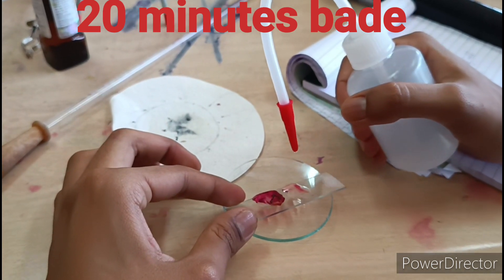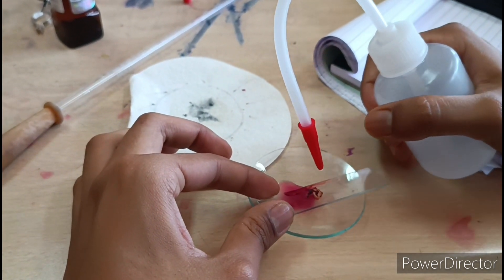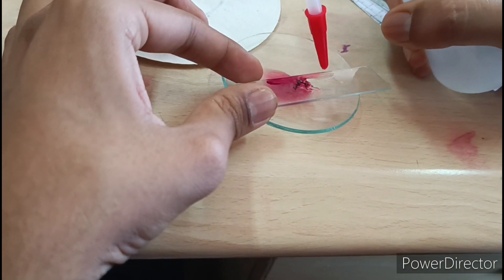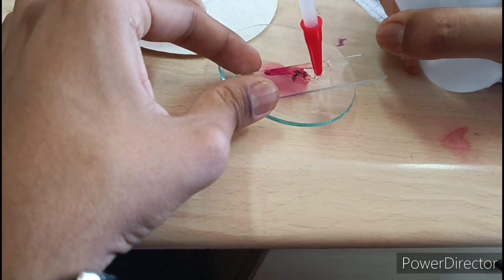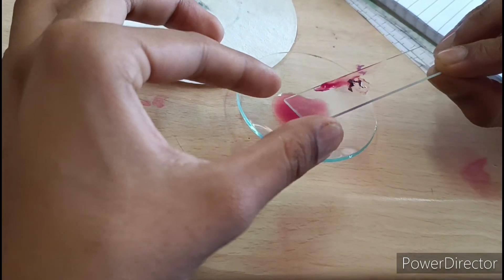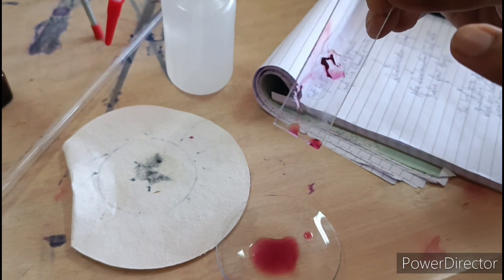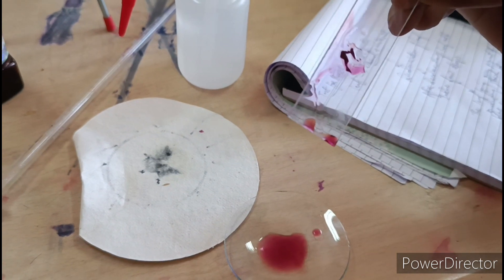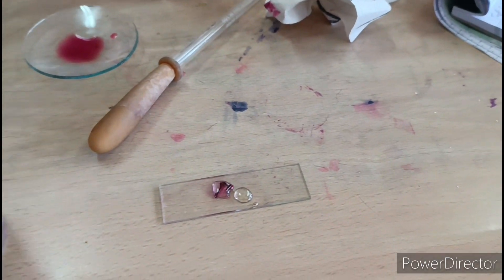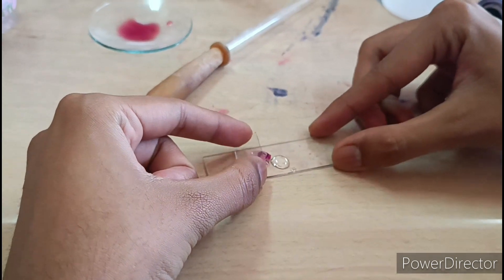We will remove the excess stain, because too much stain will interfere — we need to absorb the excess stain. Now we will absorb it and mount it. We will put the specimen, spread it, and remove excess stain from it.